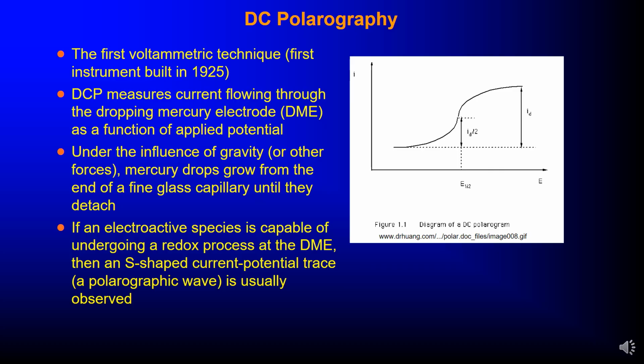Generally, as we will discuss further, polarography is effective in qualitative identification of unknowns, and in studying the rates of chemical reactions that compete with the electrode reactions.